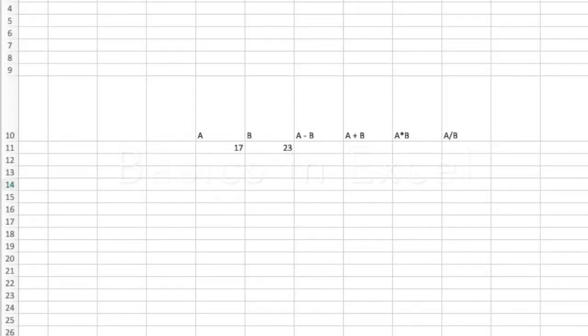This video is meant to be a short, basic overview of using some basic math functions in Excel, and then how we can apply these to our lab this week, where we are calculating RNA concentration as well as doing some math to figure out the volume of our samples that need to be loaded into our RNA gels.